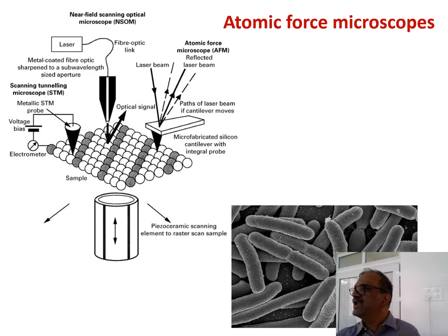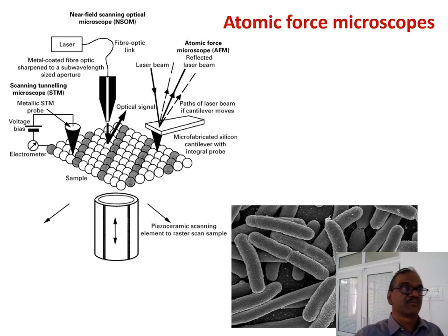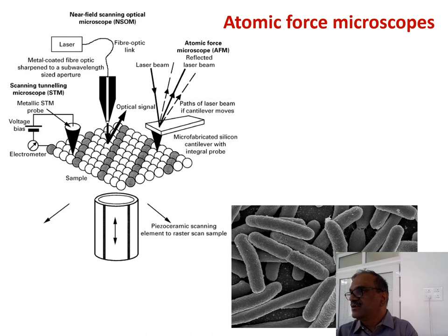So if you magnify our finger 1 lakh times, it looks like a higher resolution image than an elephant's leg. Am I right? 1 lakh times higher image. Similarly, you have to see what the relative size is. And also, always when you are drawing a diagram, or taking a photograph, or scanning some specimens, you have to state how many x magnification, and how much resolution you are able to get.